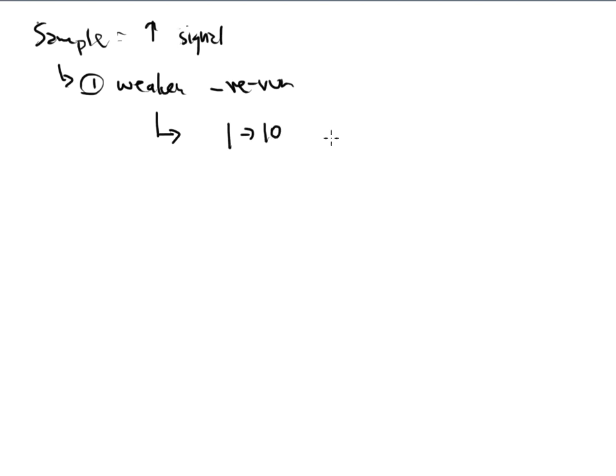Well, this could be written a number of different ways. We could say a 1 to 10 ratio, and basically what that means is that 1 mL has been diluted to a 10 mL volumetric flask. Okay, that's how we read that. So don't let that colon throw you off. It's just a shorthand way of explaining how we diluted the sample.